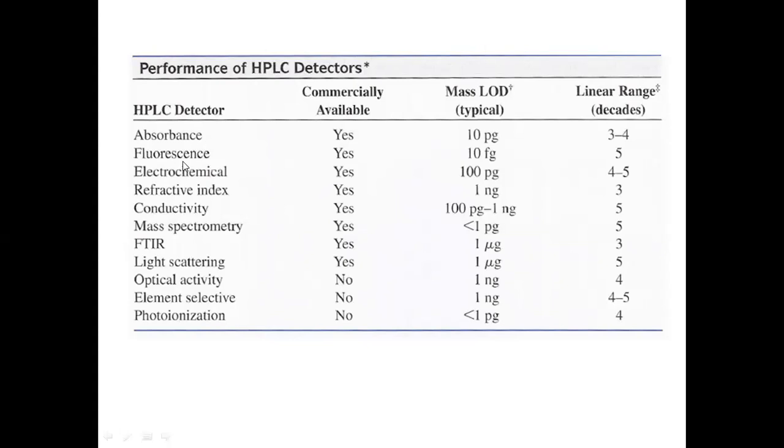Fluorescence detectors will be working based on the principle of fluorescence, molecular fluorescence. It is mainly a molecular phenomenon, molecular excitation going to take place. When you apply energy by means of light radiation, the molecule absorbs the light radiation and it will excite to the higher energy level, and the light absorbed by the molecule is called the excitation radiation, which will have a particular wavelength that is called the excitation wavelength.